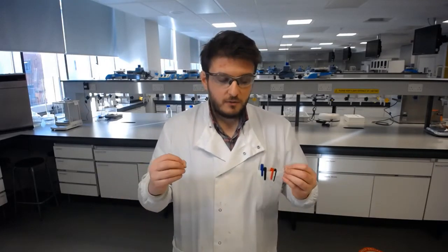And that's what we're going to look at when we do the bismuth suspensions. We're going to look at different strengths of electrolyte solution. So we're going to be introducing different charge into that suspension, and we're going to see how well that stops particles from getting close to each other and how well that we can redisperse those suspensions after they do eventually split.